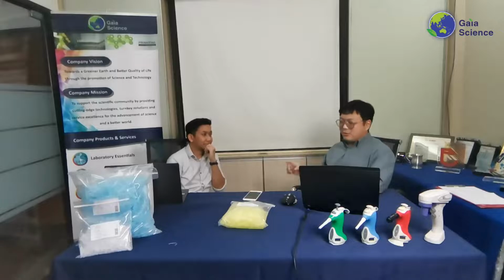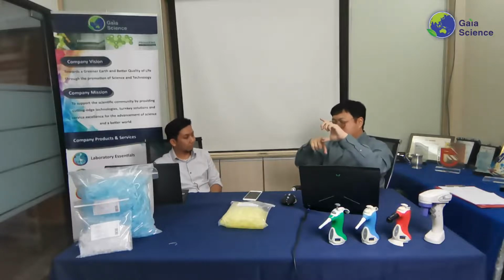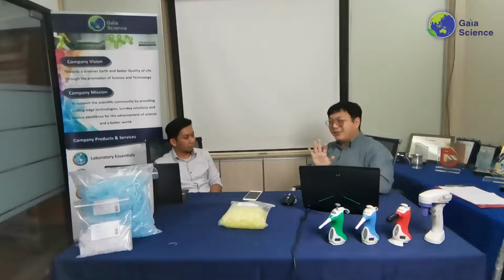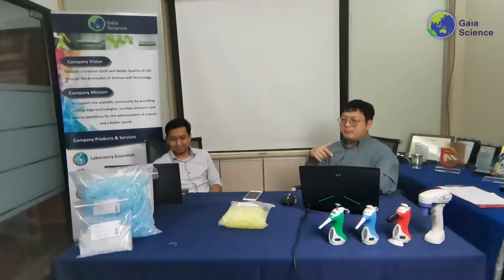Yeah, it is. The wide orifice ones are basically the tips, if you have a photo of that, you can put it up, where the bottom part is actually much wider. You will notice it looks as if the pipette tip is broken. It's not, unless you purposely cut it open, of course. Some people could do that. We call them wide orifice tips, or sometimes wide bore tips. They allow samples to be easily aspirated up and down.